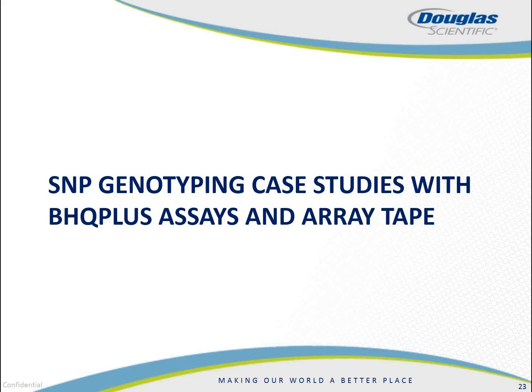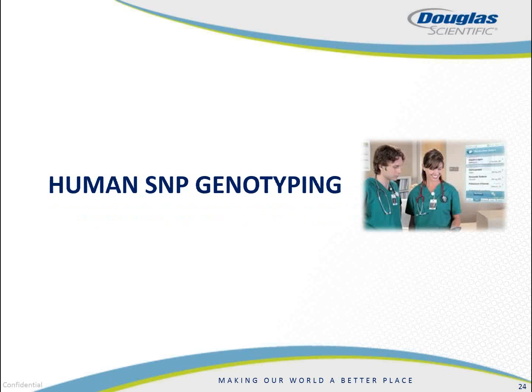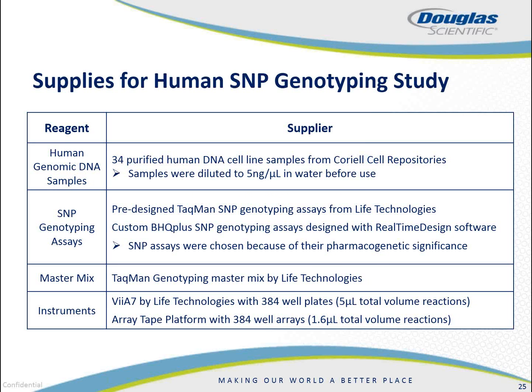So now we're going to move over to some SNP genotyping case studies where we use BHQplus assays and the ArrayTape platform. And we're going to start with a human SNP genotyping experiment. For this study, we started with human genomic DNA samples, 34 purified DNA samples from cell lines that we purchased from Coriell Cell Repositories, and these samples were highly purified and diluted to 5 nanograms per microliter in water before use.